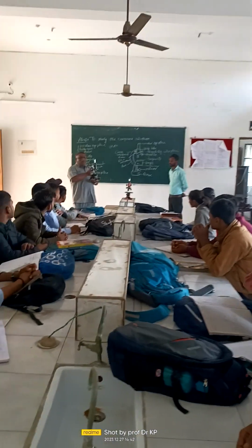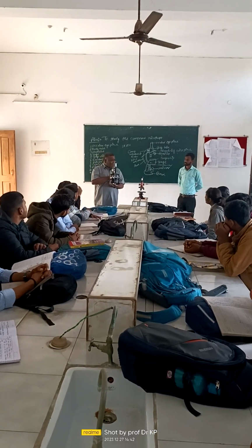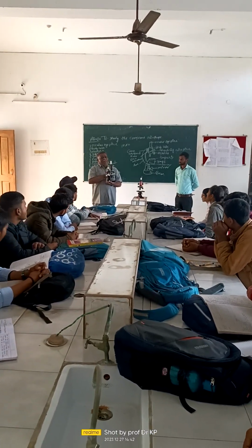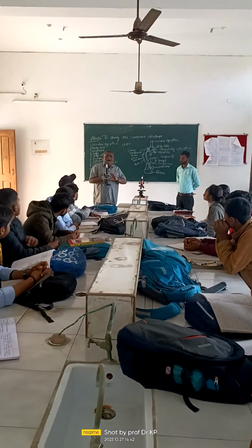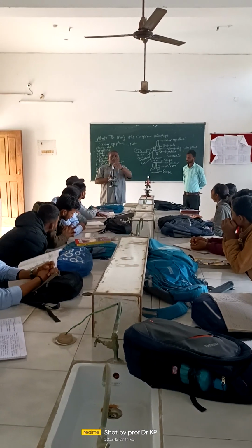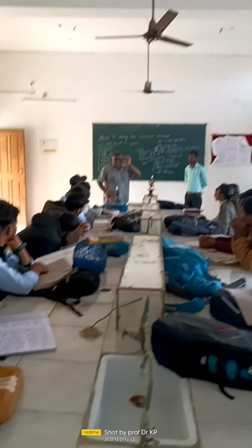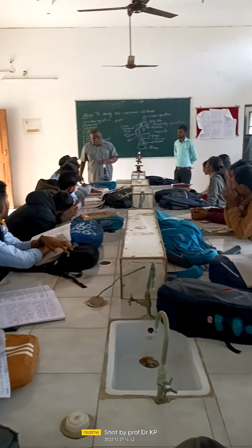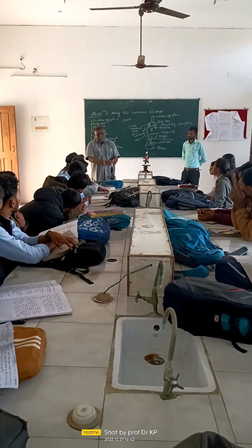So, how to focus the material under the microscope? First of all, you should be exposed to the different parts of the microscope. Then, when your teacher says, you can easily manipulate or arrange the parts in order to focus the material. Starting, as I told you, there is a lens called the eyepiece. What is it? Eyepiece lens. Maximum 5 to 10, now 10x.